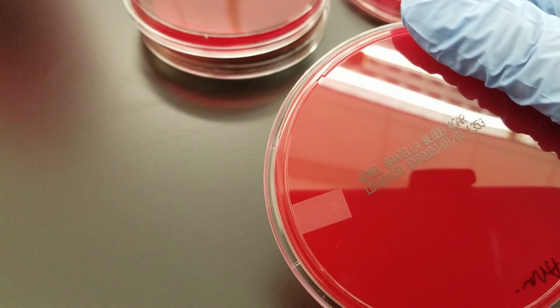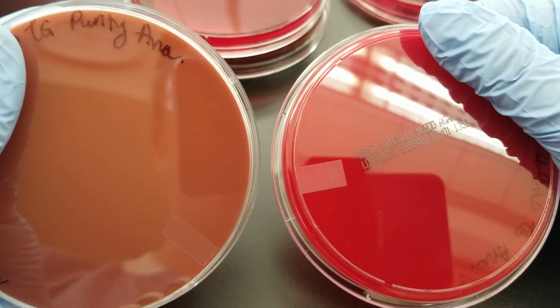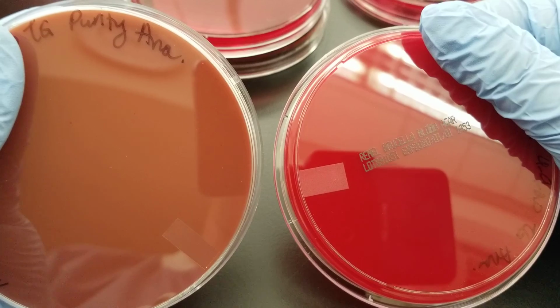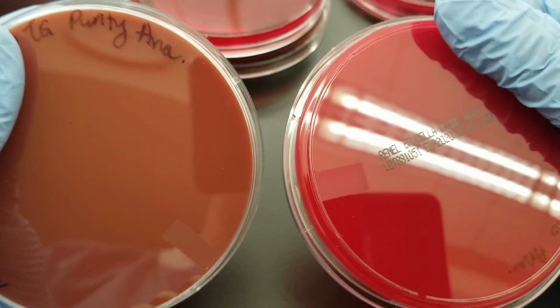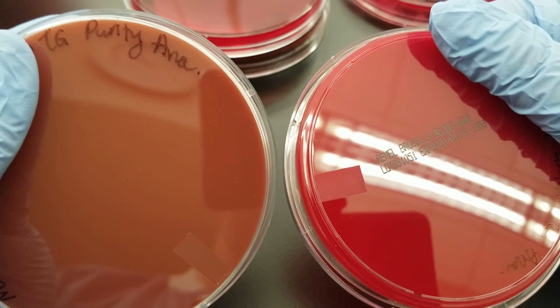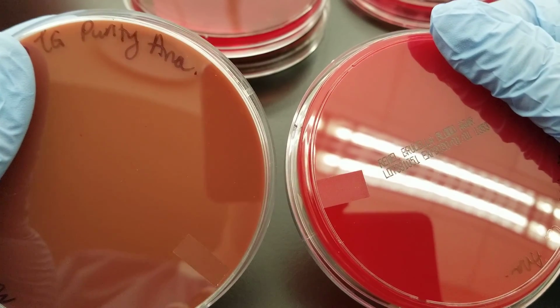If you did that purity plate right beforehand, you'll know it wasn't due to lack of organism, because if it grew on the purity plate but not on this one, then you'll know it's not from lack of organism being there.